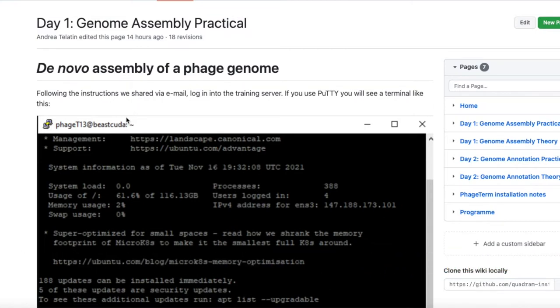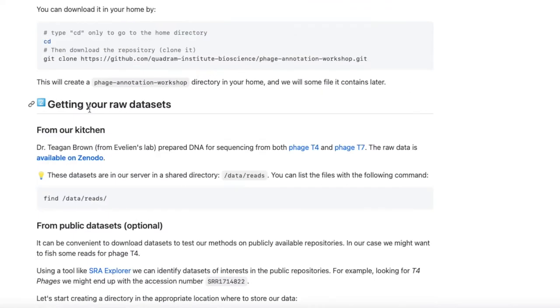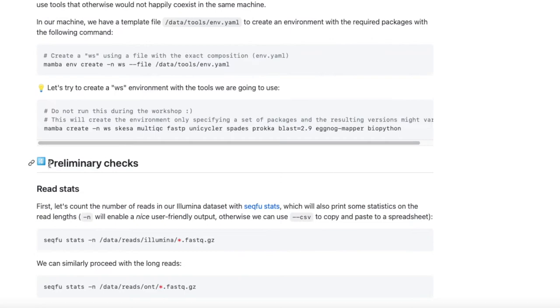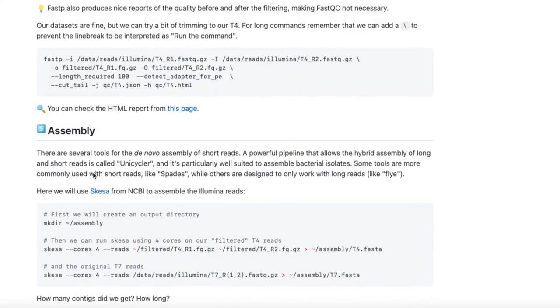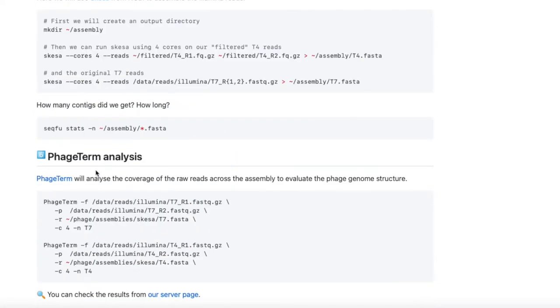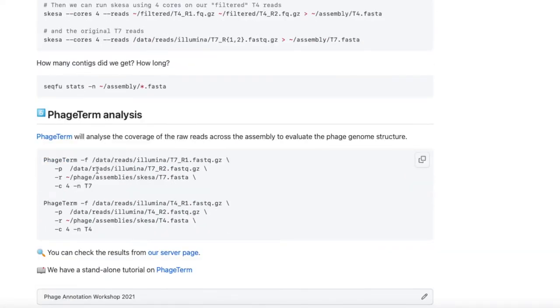In this screencast, we will log into our remote server and install Miniconda, the most used package manager in bioinformatics, to install the tools we will need for the practical. Then we will have a look at the raw reads produced from our sequencer. We will perform a QC of the raw reads, then perform the de novo assembly and check how many sequences we produce. The last step will be to use a program called PhageTerm to check the structure of the phage genome.